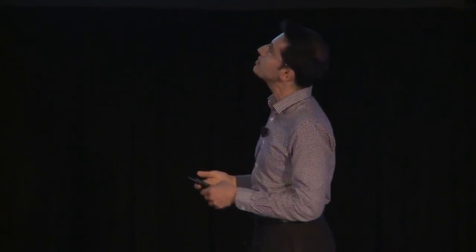You have seen a number of presentations today from different members of OpenPOWER that showed improvement in performance in various genomics pipelines, for example. And we would like to bring all those activities together and enable them from a technology point of view to make them faster and easier and cheaper. I will discuss as well, as part of this effort, our work in accelerating a specific pipeline that is used in cancer diagnostics.